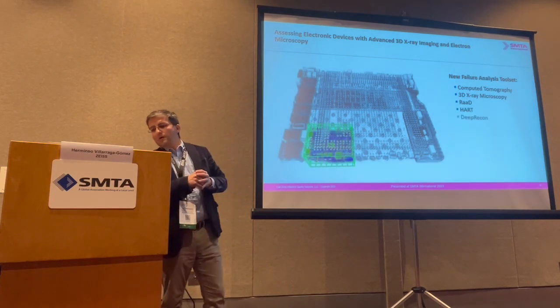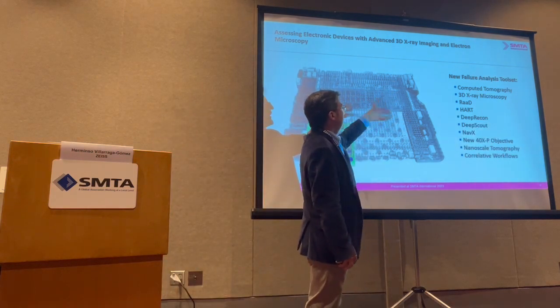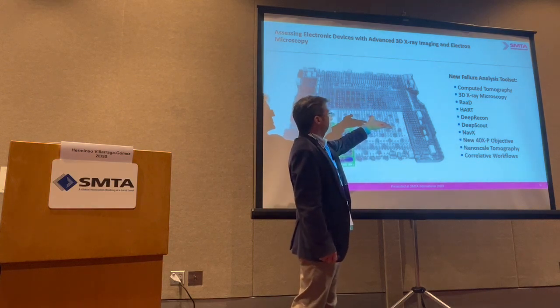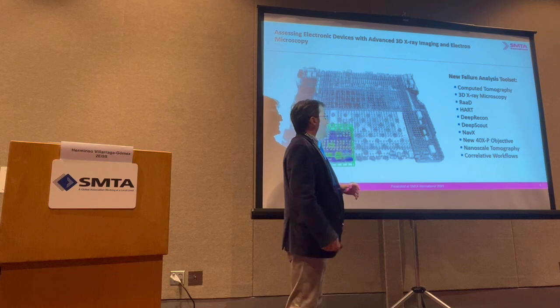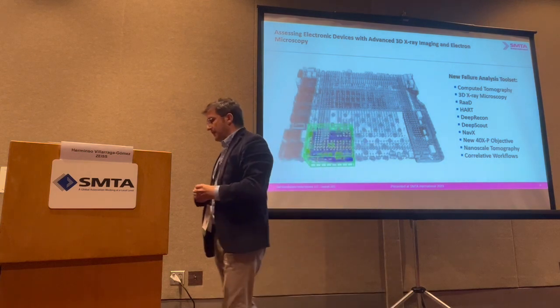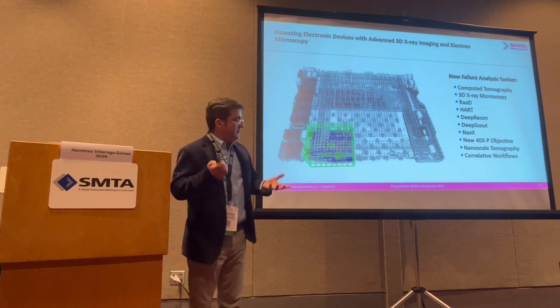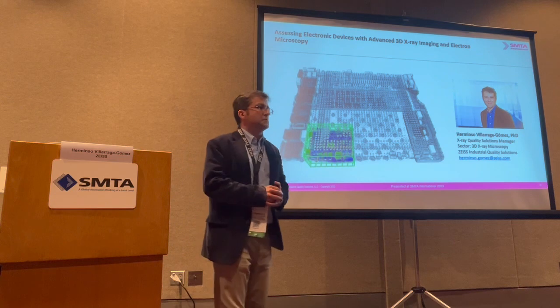So I'll give you a little bit of a summary of what we have talked about today. Some improvements on ways of detecting with X-ray microscopy for electronic components, using resolution at a distance, deep learning, a couple of packages, DeepRecon, DeepScout, some operating system to optimize the settings, new detector developments, nanoscale tomography, and correlative workflows, which include SEMs. With this, I'll be happy to take any questions you might have.